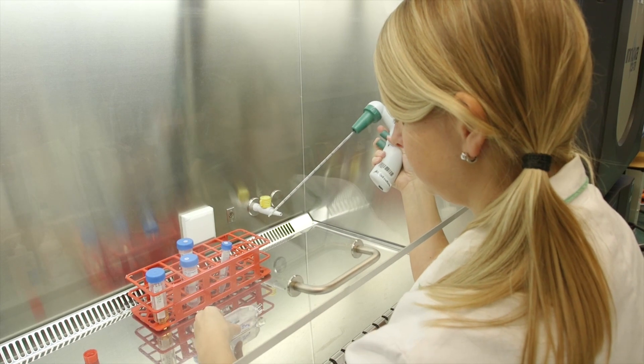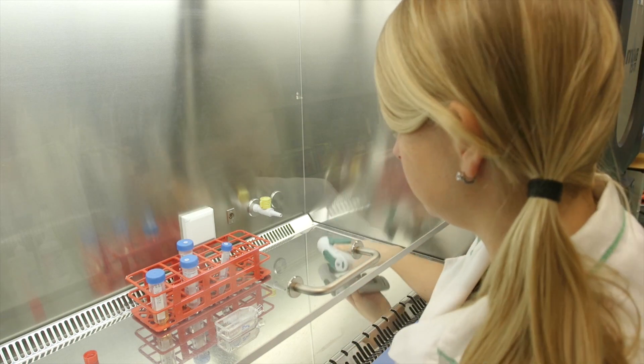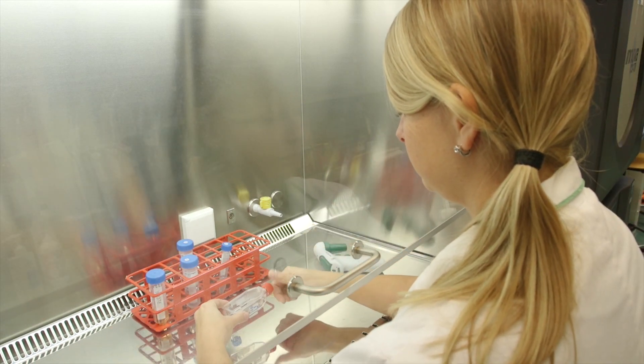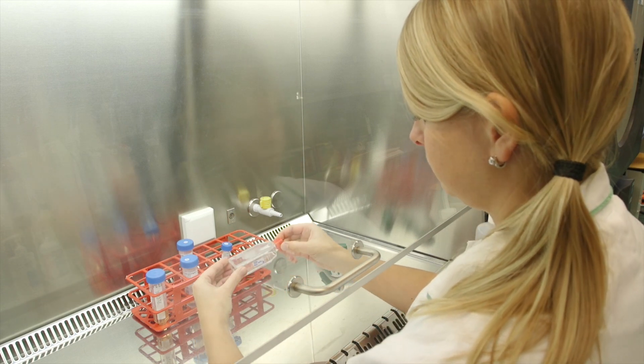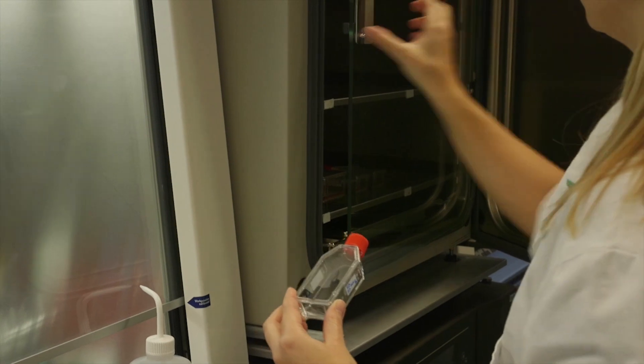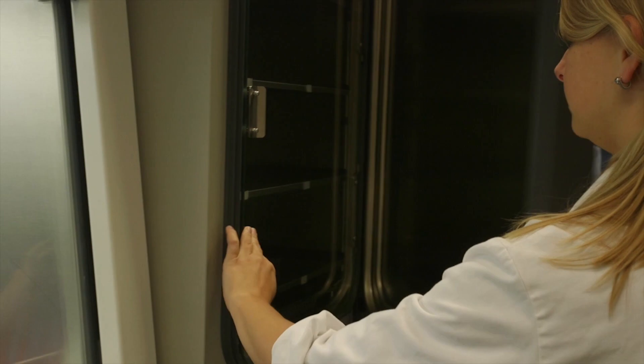After washing and removing the PBS for the second time, you can add the trypsin to the cells. Add 1 ml of trypsin. Close the lid on the flask and ensure the trypsin is distributed evenly over the cells. Then place the flask in the incubator. Trypsin is an enzyme which performs best at 37 degrees Celsius.